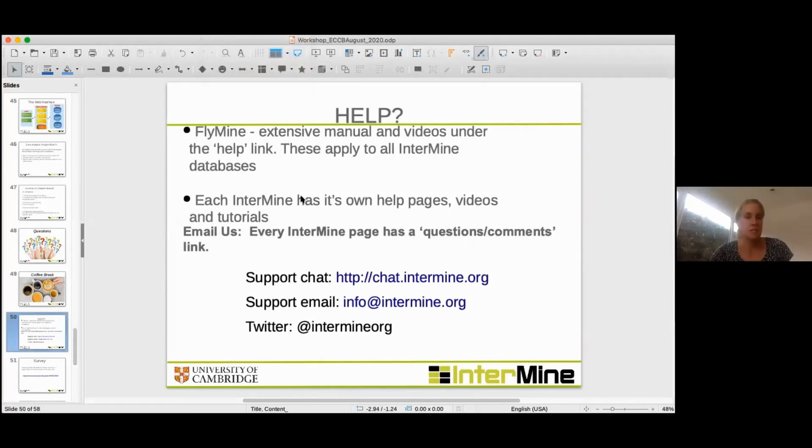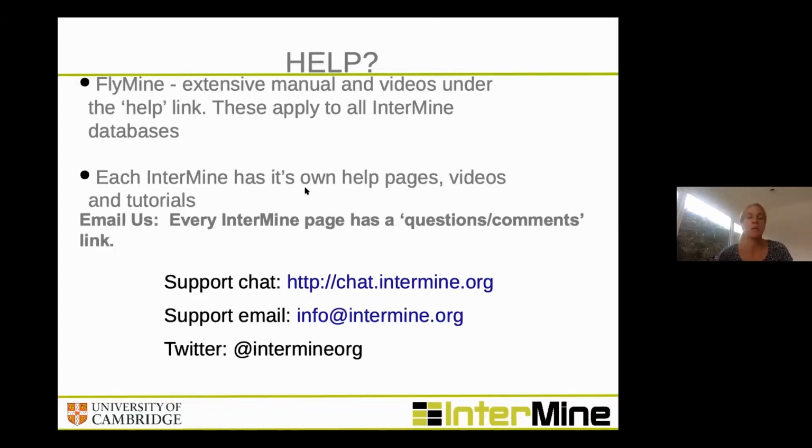Okay, so just to finish up, we've shown you an awful lot today, and so I'm sure you haven't remembered and taken it all in. So if you need more help, if there's anything more you want to know about, then we have lots of online help.